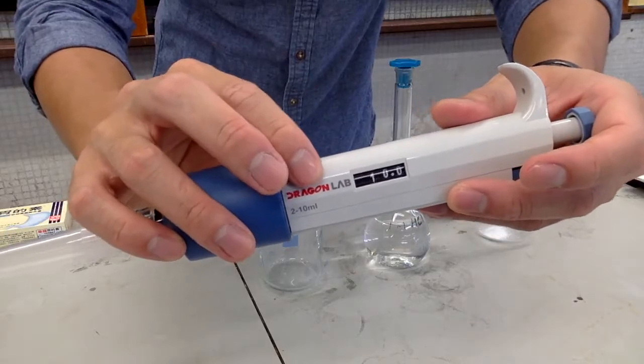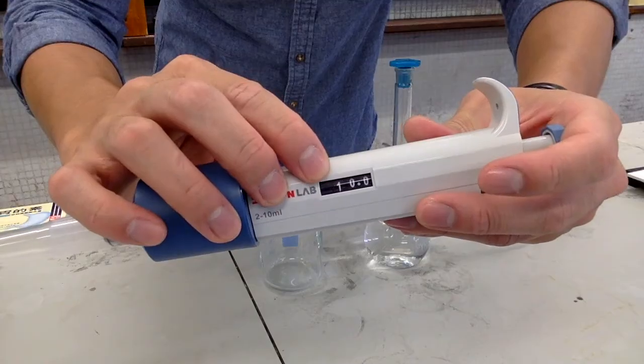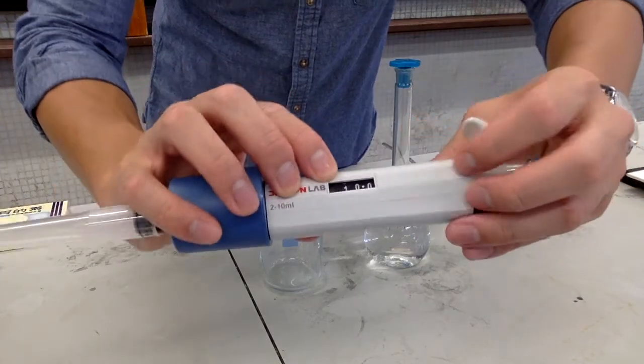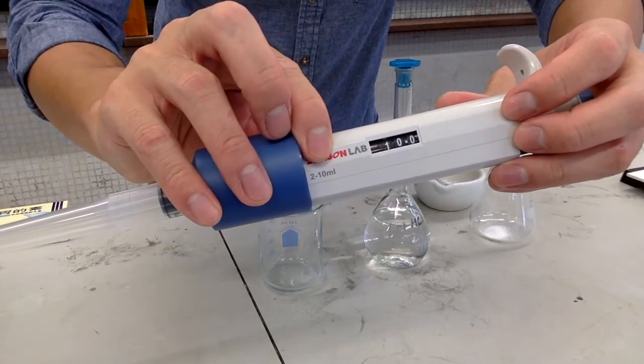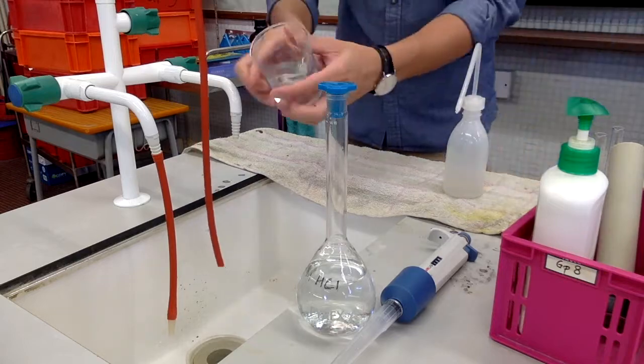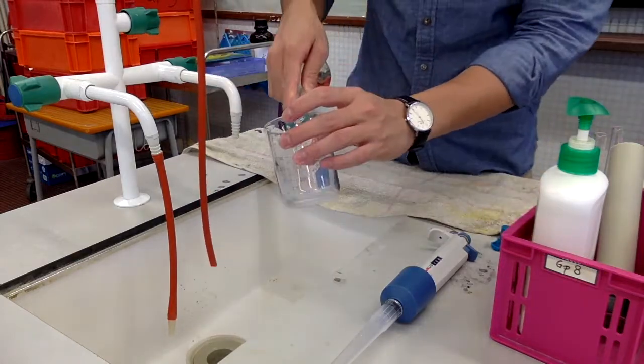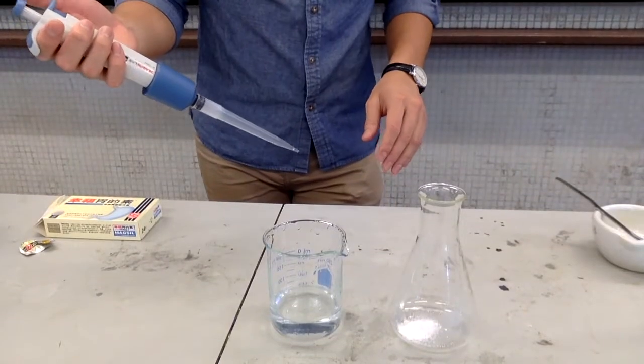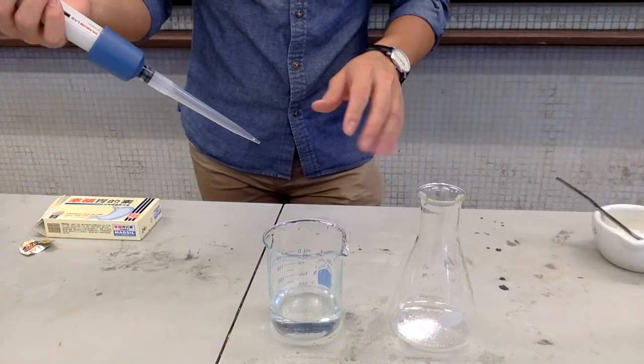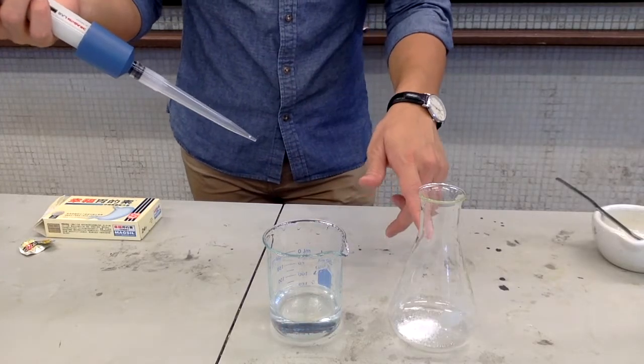As you can see from the scale here, it reads 10 and this micropipette can measure from 2 ml to 10 ml. Now, transfer 20 ml of hydrochloric acid into the conical flask.